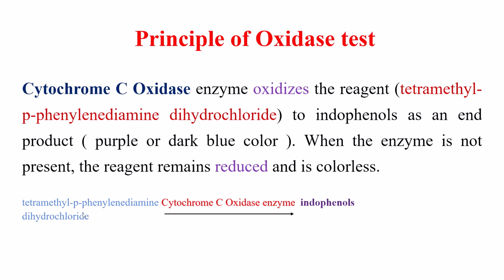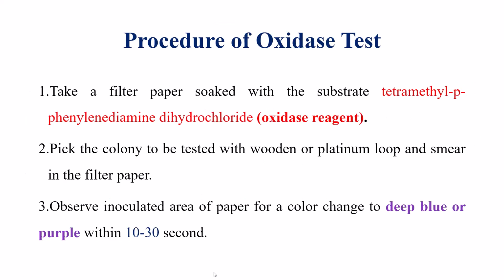So in the presence of the cytochrome oxidase enzyme produced by some types of bacteria, the reagent changes to indophenol and the color changes to purple or dark blue.